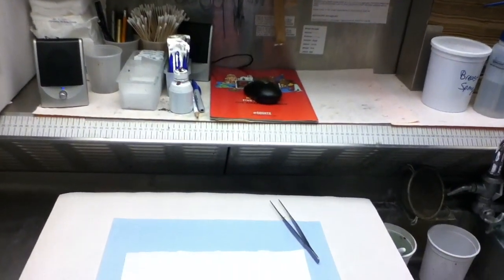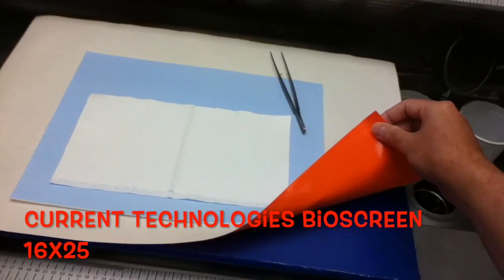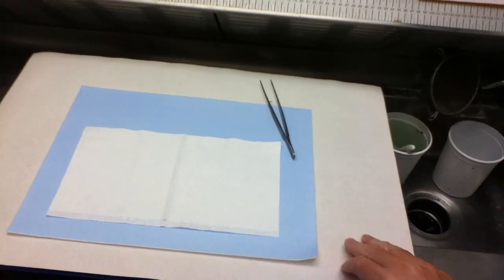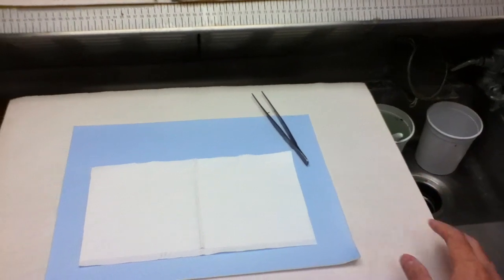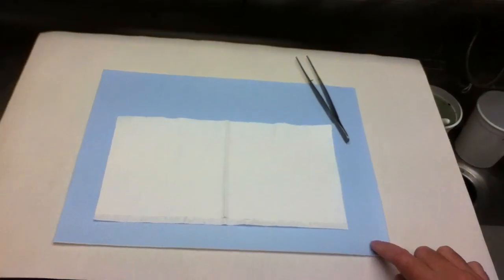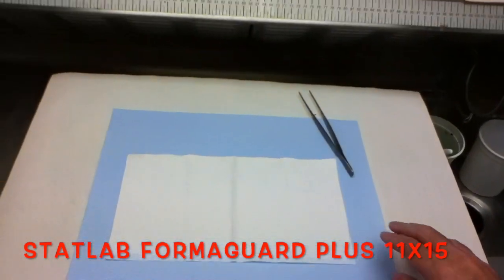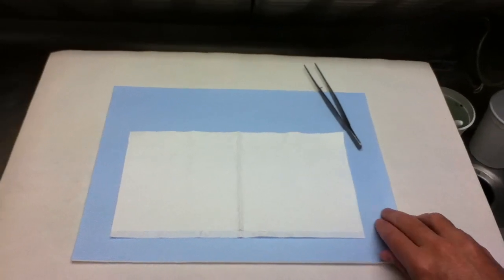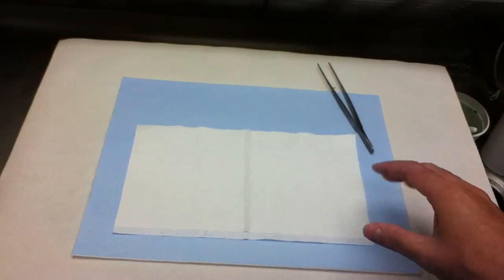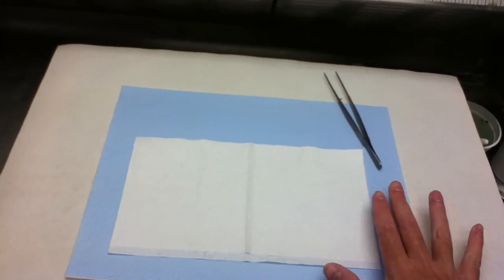Down here I have orange absorbent pads on one side with a plastic water barrier on the back — good because they don't dirty your cutting board, and if something is large and very messy you just roll it up and throw it in the trash. These are called the Formalin Guard Plus absorbent neutralizing pads. They're a bit expensive, but they're filled with a neutralizing chemical so when formalin hits them it doesn't just sit there releasing fumes — the formalin is neutralized, basically turning it to water.